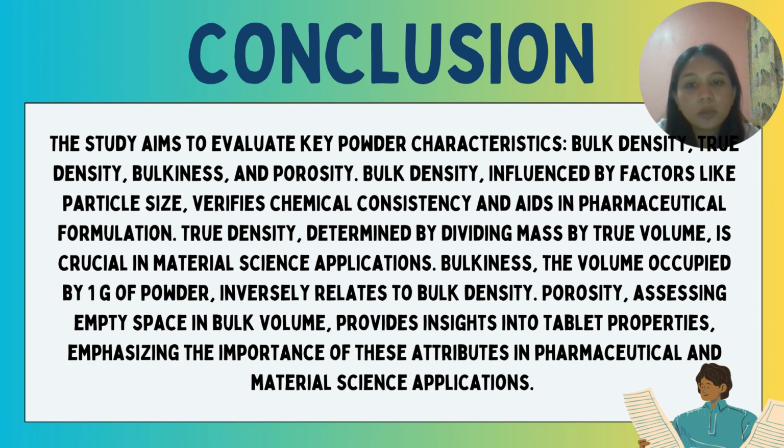Bulkiness, the volume occupied by 1 gram of powder, inversely relates to bulk density. Porosity, assessing empty space in bulk volume, provides insight into tablet properties, emphasizing the importance of these attributes in pharmaceutical and material science application.